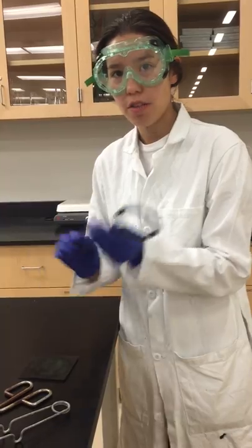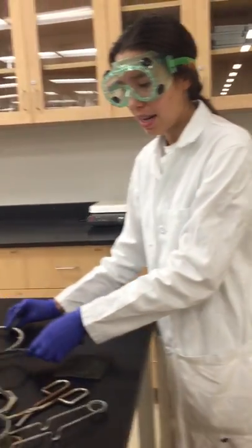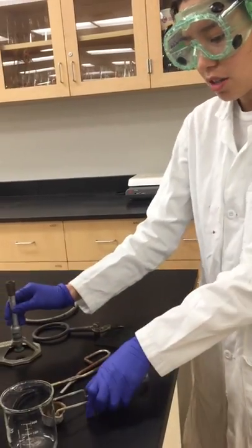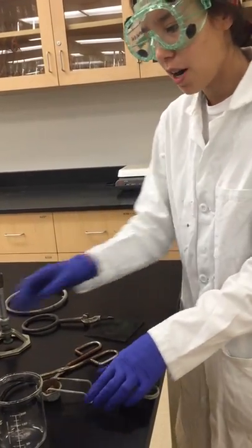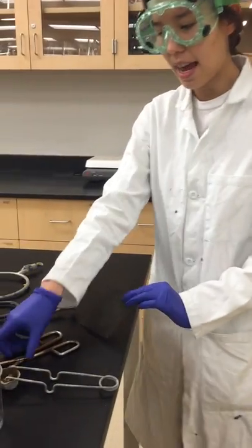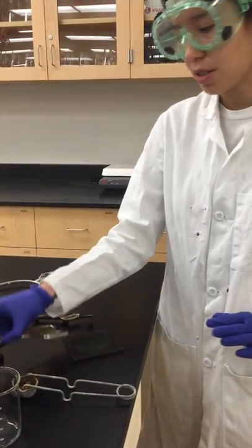So the objects are the first metal ring stand and the second metal ring stand, or the first metal ring and the second metal ring, the Bunsen burner, the striker, which produces a spark, the rubber hose, the ring stand, the wire gauze, and beaker tongs.